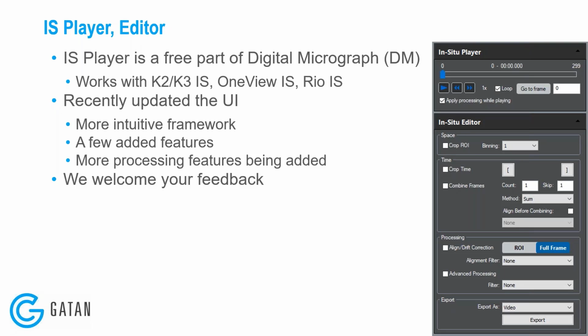But recently we updated the user interface. So if you have been using the in-situ player in the past, this looks very different. And we've done a lot of work on it to make the framework of the in-situ player more intuitive. We've added a few features, and we're continuing to work on more processing features that we'll be adding.